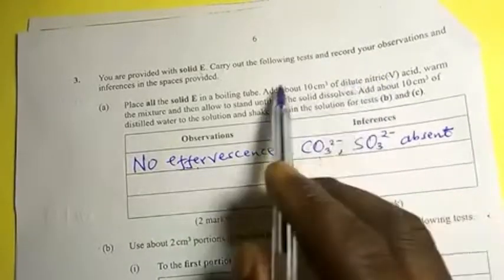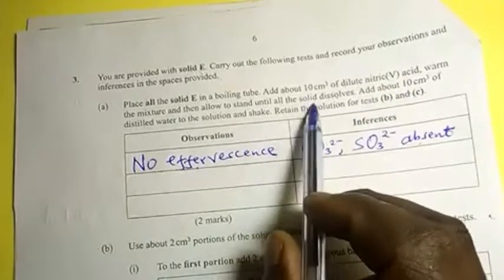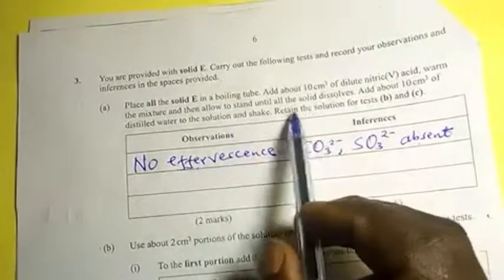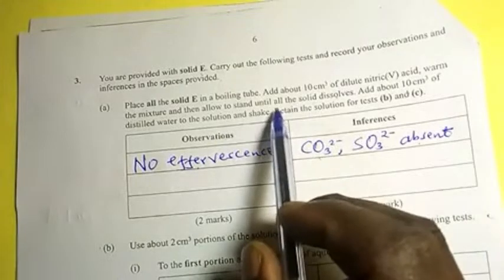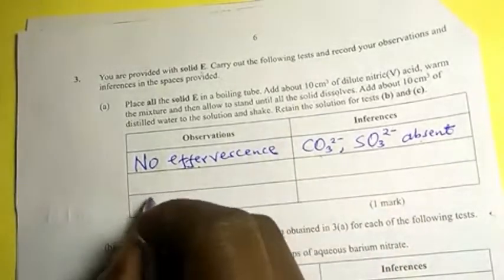And after that, you are supposed to add water. What happened? Did the solid dissolve to form a colorless solution, or which color? What was the color after dissolving in water? So for this one, that is another observation you need to make.